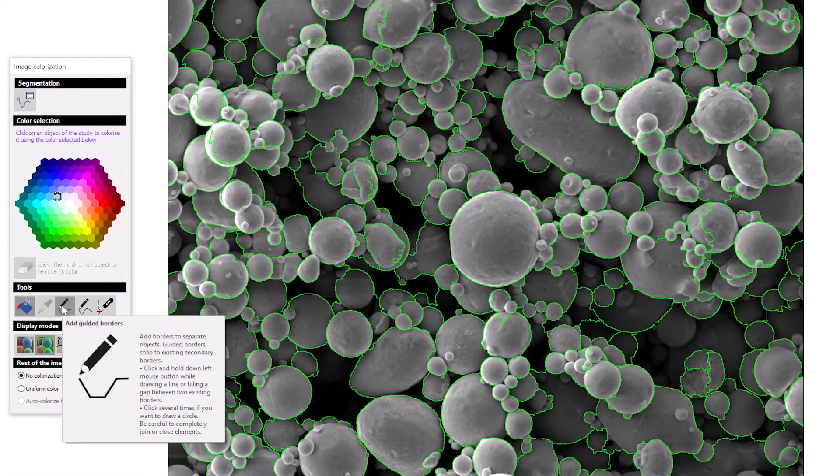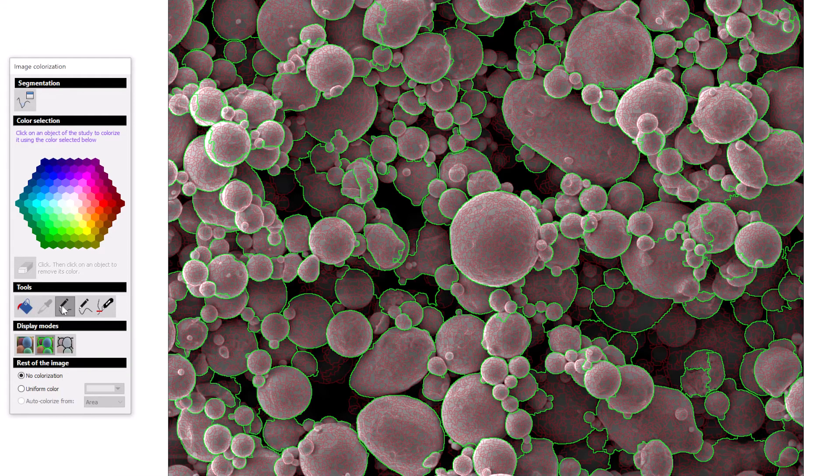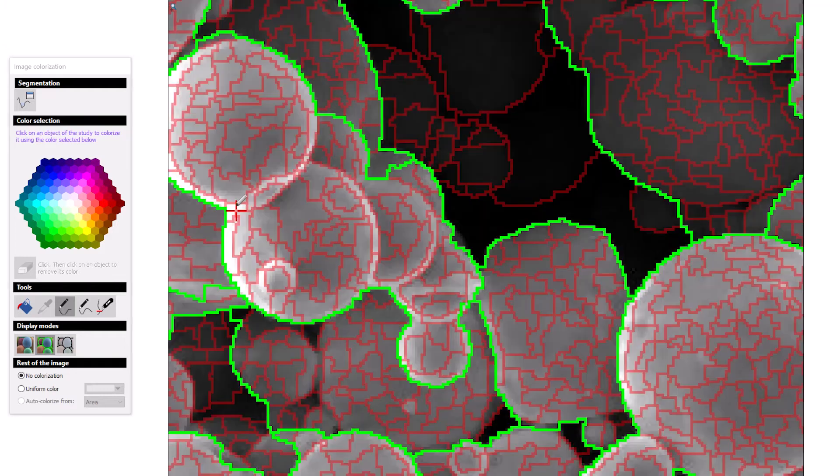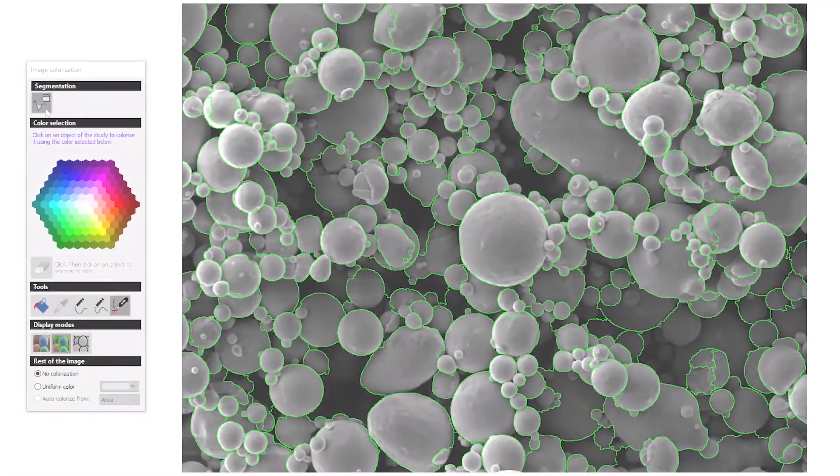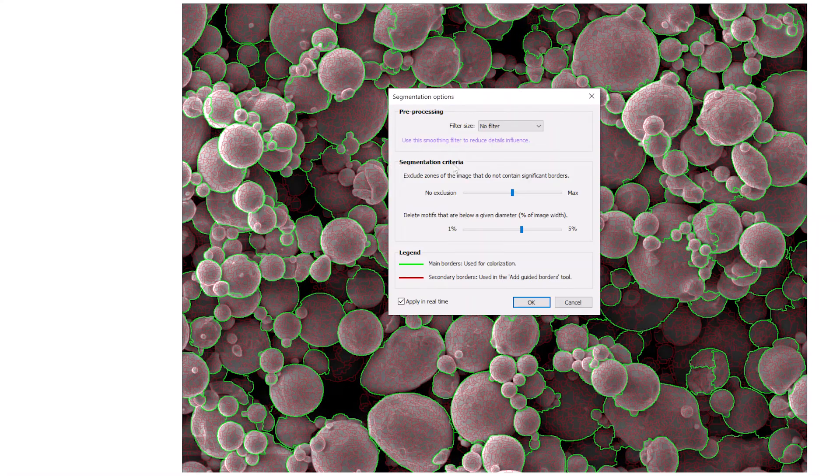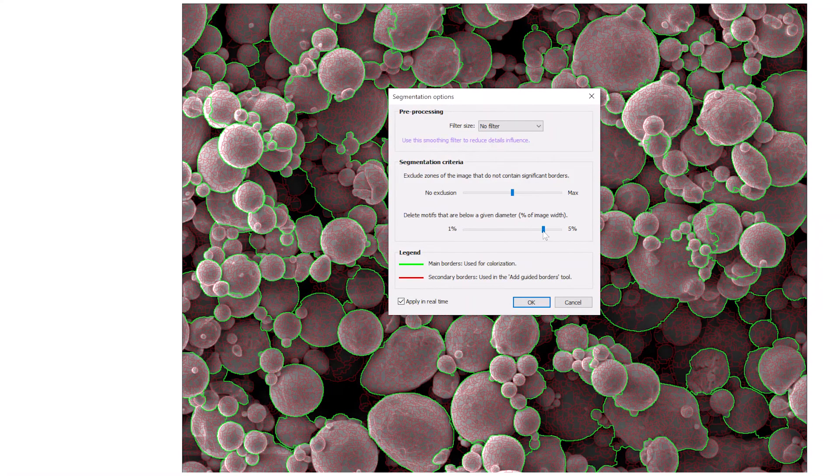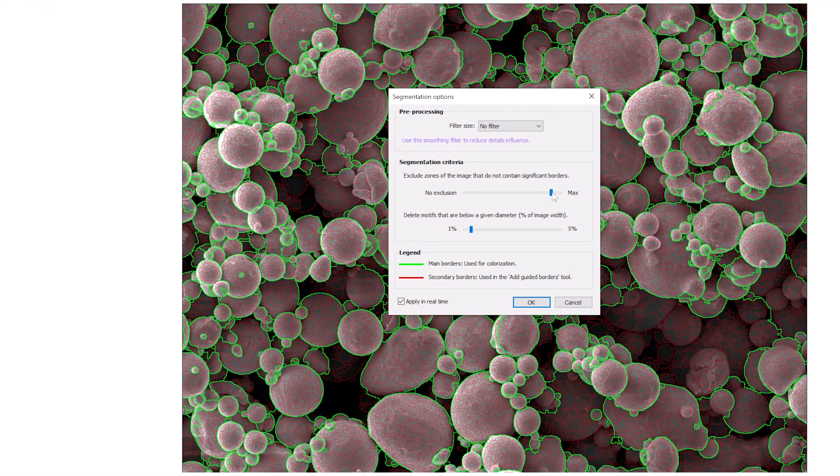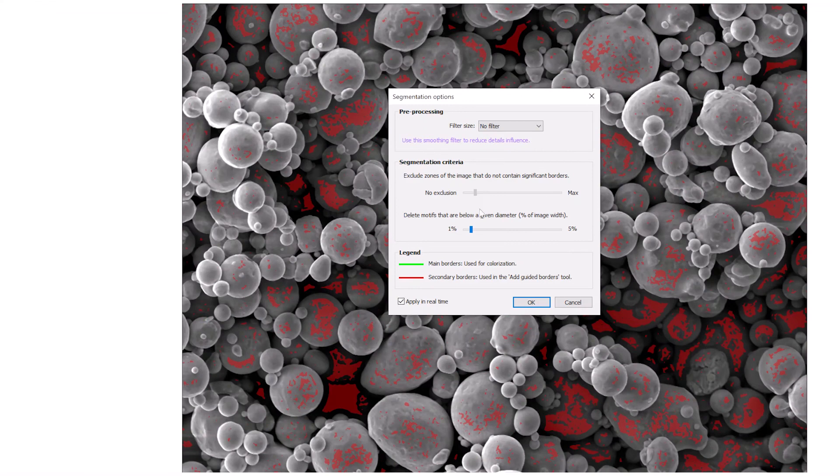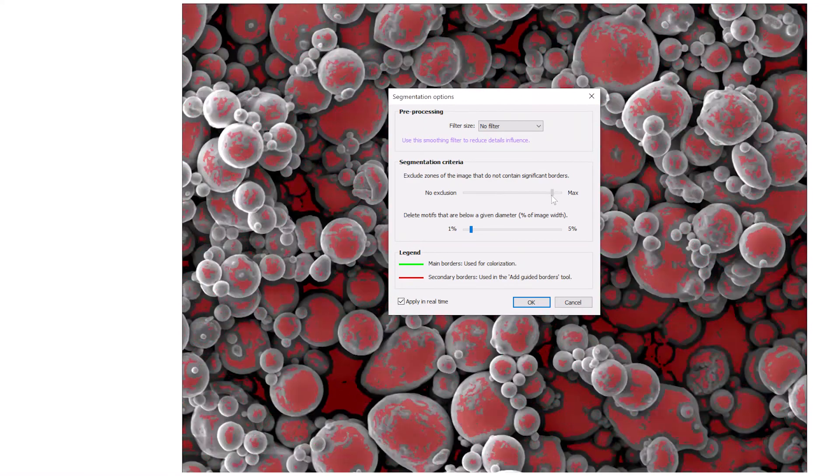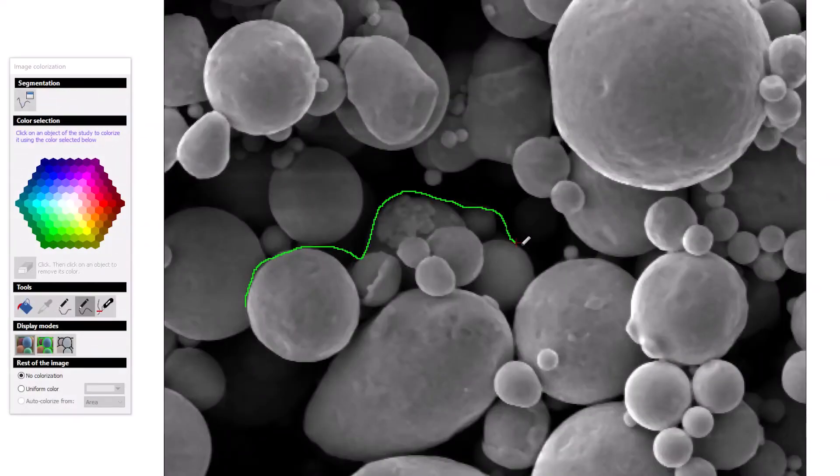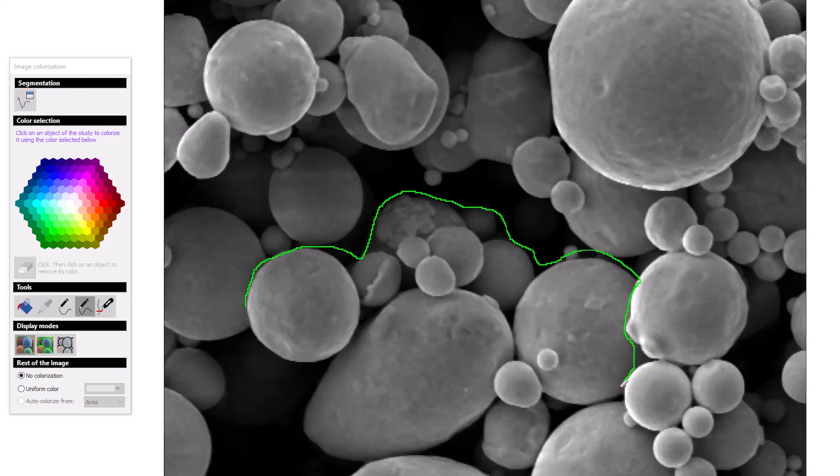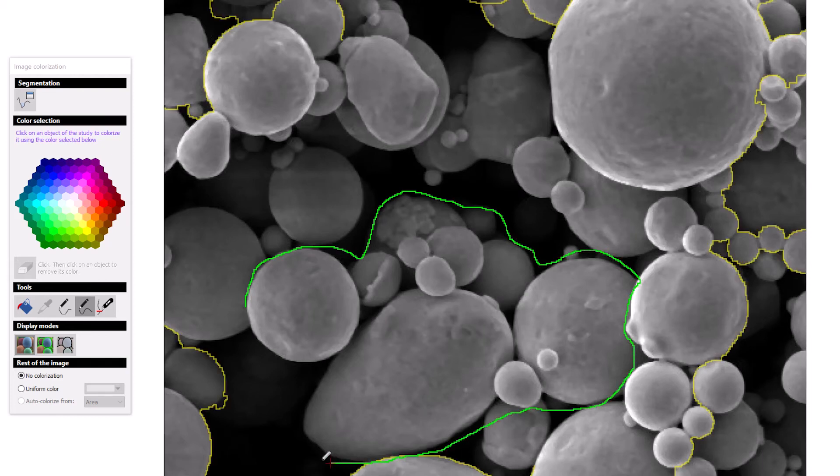You can add new object borders based on existing detail in the image detected by Mountains. You can adjust segmentation options for more complex objects such as in this image. You can also draw your own borders freely.